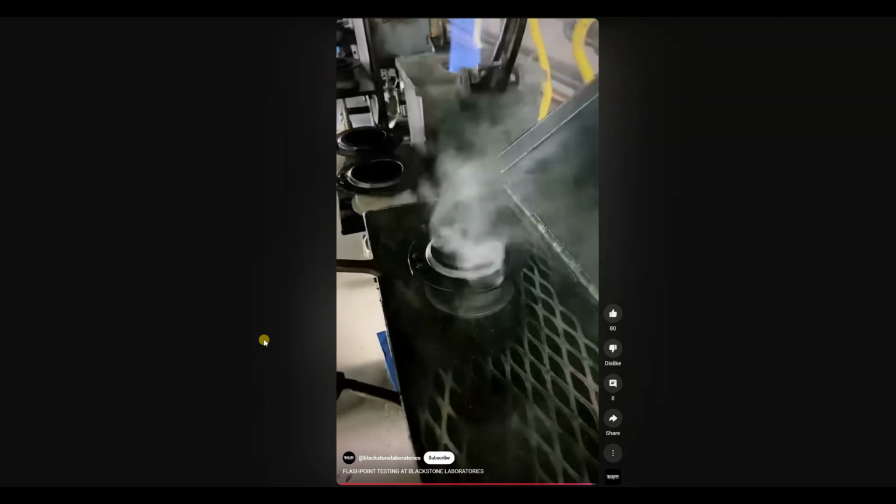Very nice. I'm glad to actually put this online. This gives an actual visual of how this sample is tested, and how you can surmise that comparing this to FTIR, with this super sophisticated instrument, is not really a fair comparison. These instruments here are much more easily deployable. FTIR, for example, you probably had to have a service contract, maybe a person or SME, which you call a subject matter expert, and consumables may be a factor. Again, like I said, I'm not an expert with FTIR. I have used it, but anyway, there is that.